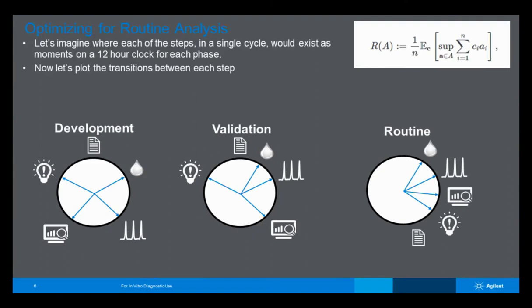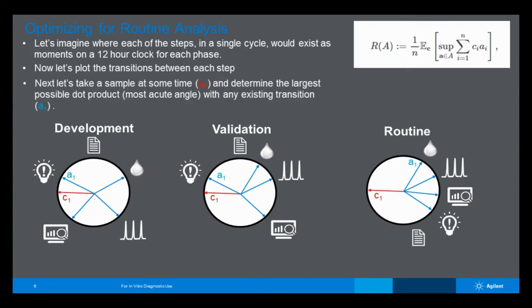So you can think about this, if you will, as like, I was born ready to do sample preparation and I died with a report in my hand, something along those lines. And we're able to do that because we're really only looking at the inflection points between each one of them, and that helps us with this model. We could potentially expand the model and change it a little bit, but for simplicity, this works quite well for the example. Now, where it becomes very interesting is when we actually start looking at how complex our system is.